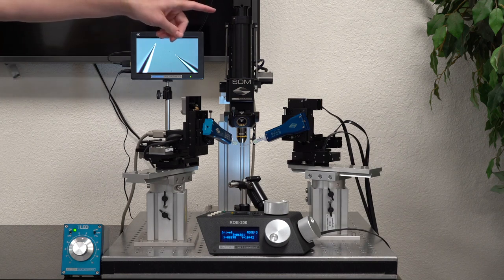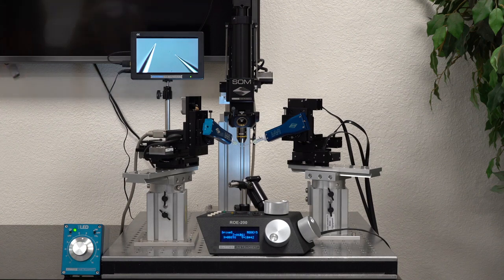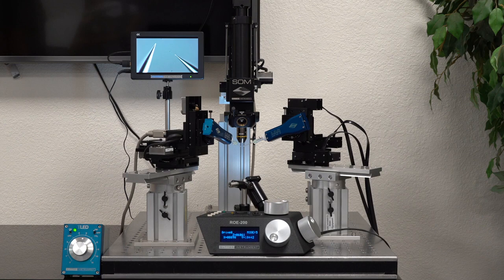The camera port here provides standard C-mount threading. You can adjust the rotation of the camera as well as the position relative to the tube lens.